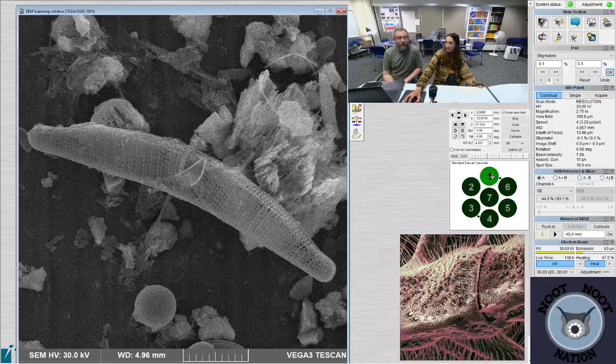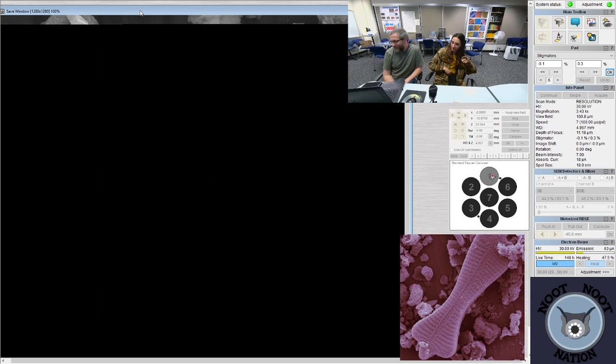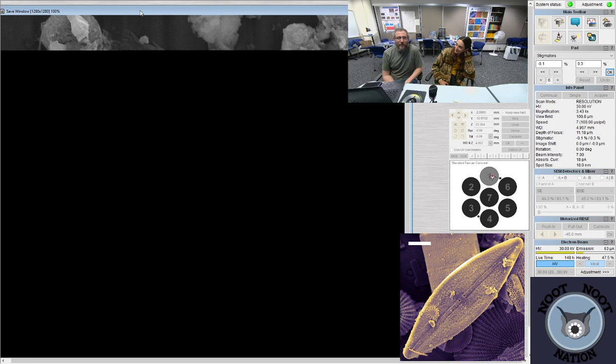That's epithemia, yeah. I think it's adnata. Three AM to nine AM. That's a crazy time slot. OpenSet's like the college DJ time slot, you know? Like he gets to play whatever he wants in that time slot because the radio station's not paying attention.